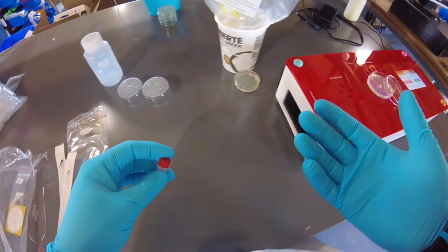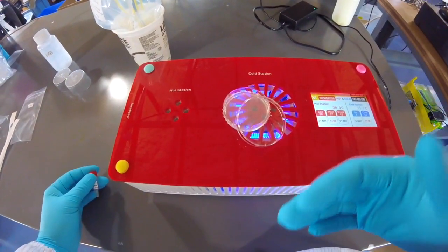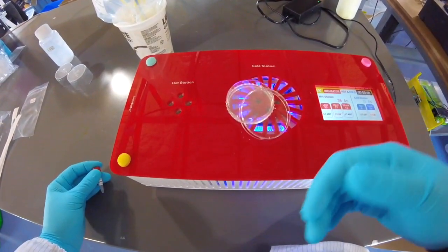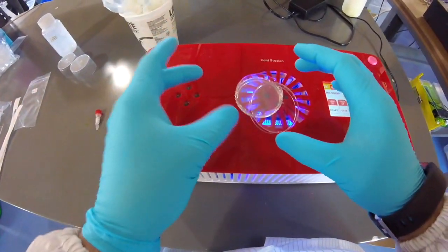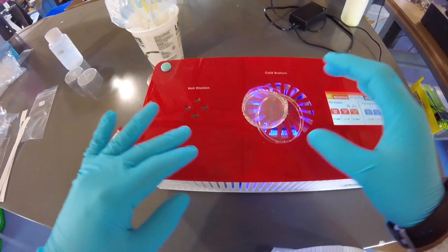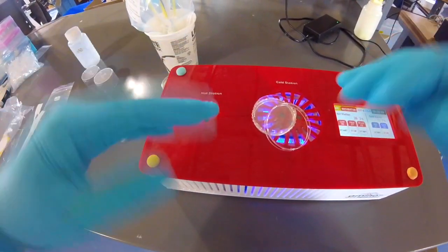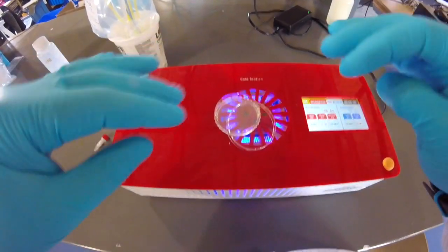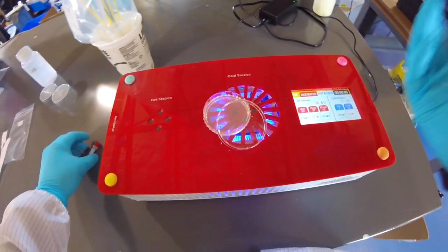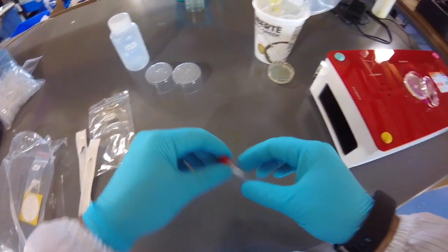So this process can take 15 minutes or so. It really depends on how hot your environment is and how dry it is. So you've just got to be patient, because ultimately we need to flip the Petri dishes over to lock in humidity, and we can't flip them over right away, because then your cells in that liquid are just going to pour into the lid, right?